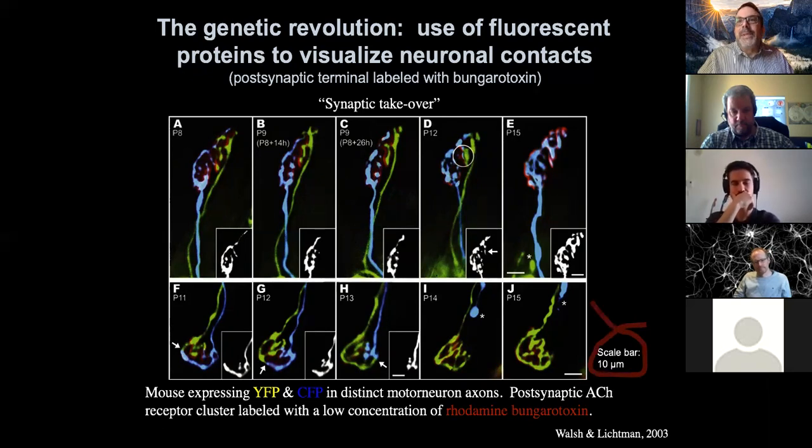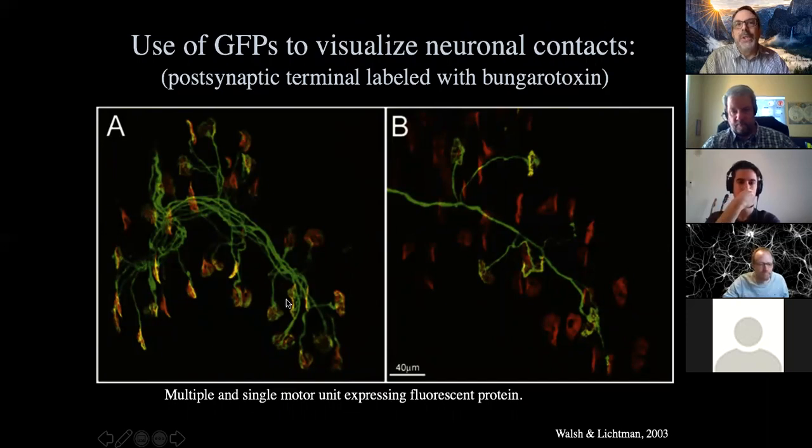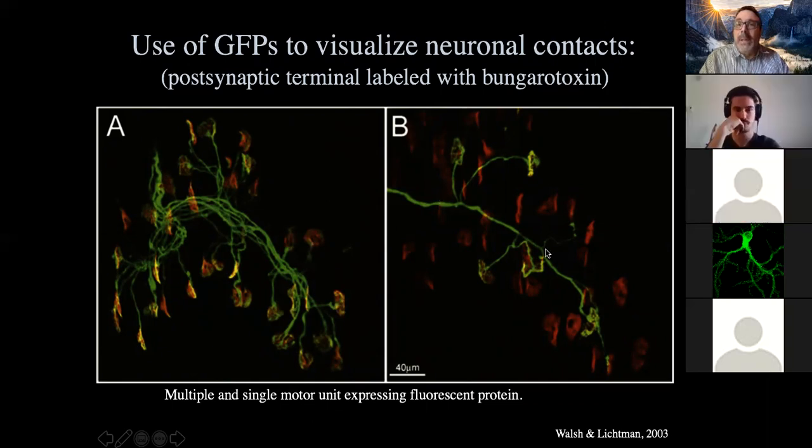Now, you'll notice that the scale of this structure is enormous compared to a typical central nervous system synapse, right? Which is on the order of a fraction of a micron. So when we want to study more complex motor units, it's possible to do imaging at the light level, and there's just a few motor neurons labeled and their projection to different terminals on the muscles themselves. You can look at single axons, or you can look at this group of axons terminating in a region and follow them over time during development or in adulthood.